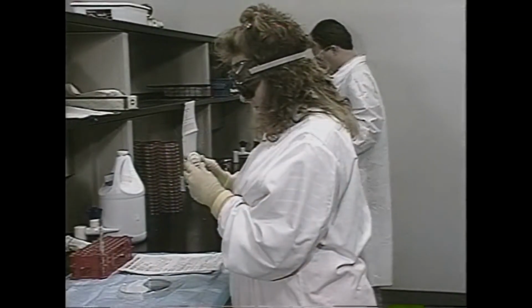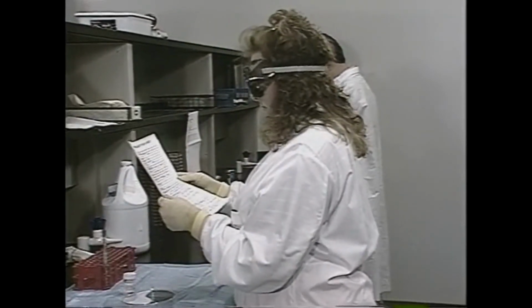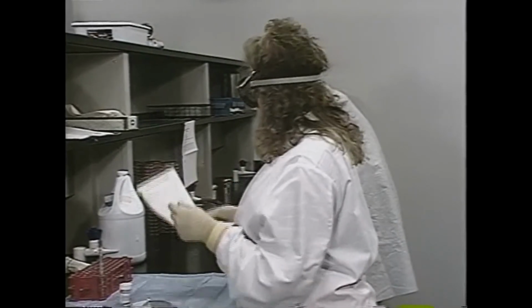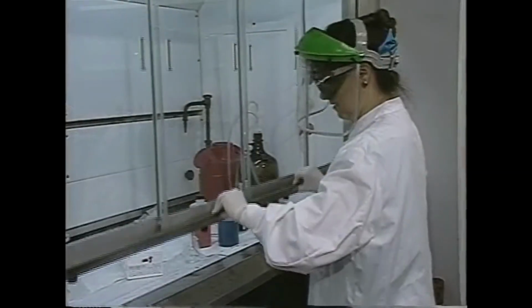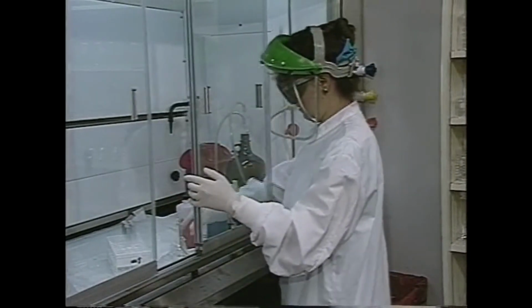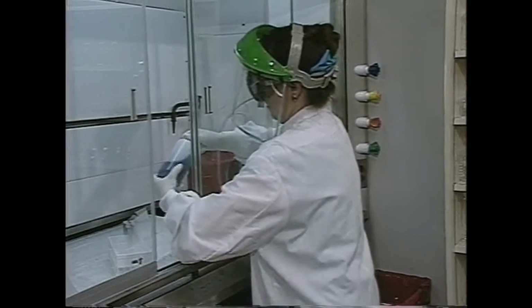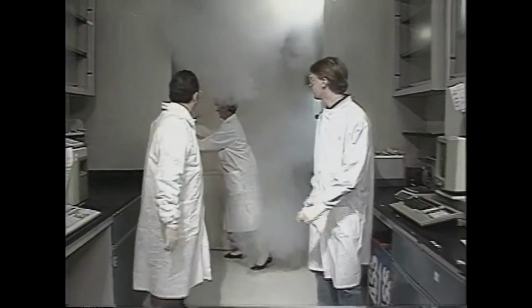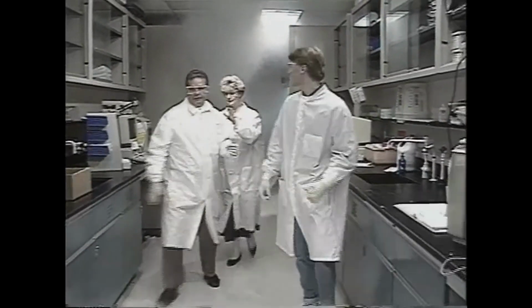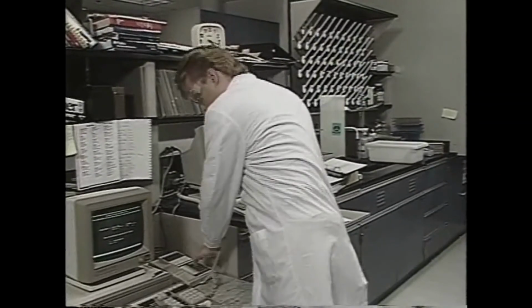Be aware of the hazards around you. Read material safety data sheets and container labels before working with a chemical or process. Take steps to minimize any dangers. Wear the appropriate personal protective equipment and follow safe work practices. Be prepared for emergencies before they happen. Know what to do, where to go, and who to contact in an exposure situation.